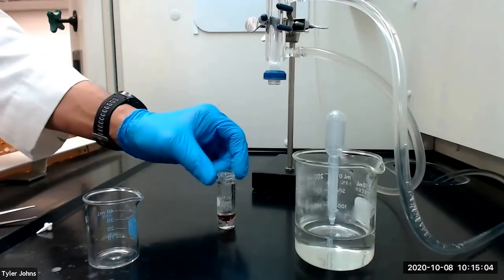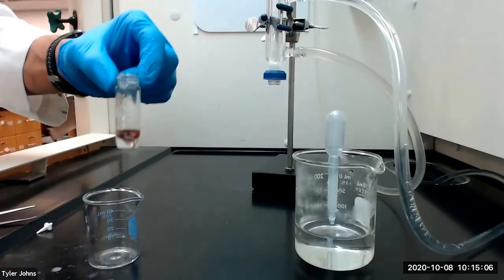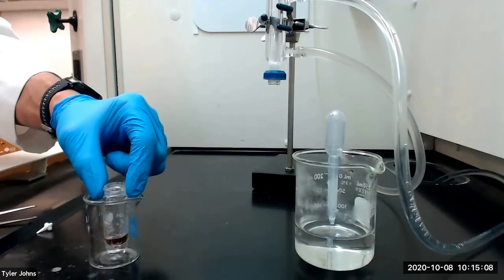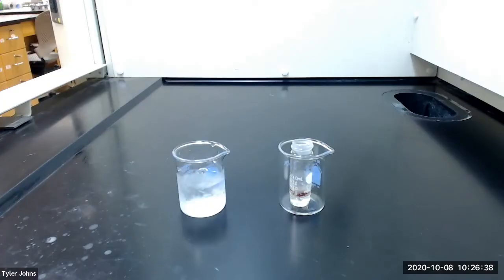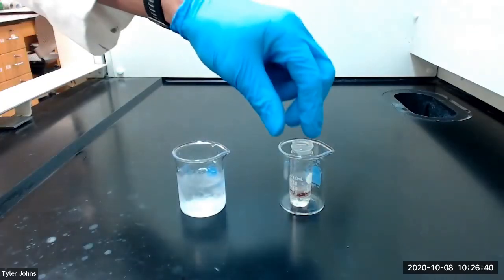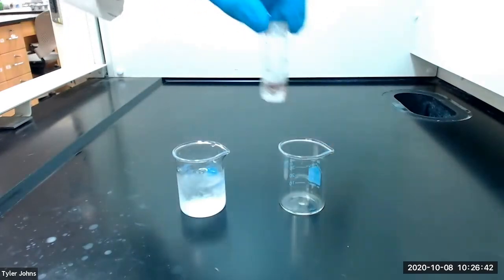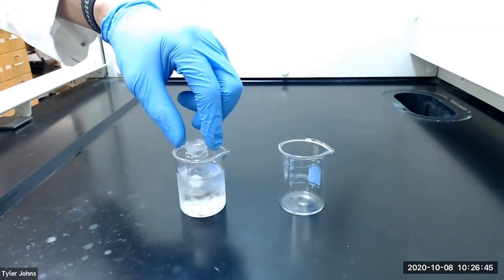We'll then place our conical vial in a 50-milliliter beaker and allow it to cool to room temperature. Once the vial has cooled to room temperature, we will place the vial for about 10 minutes in an ice water bath to complete crystallization.